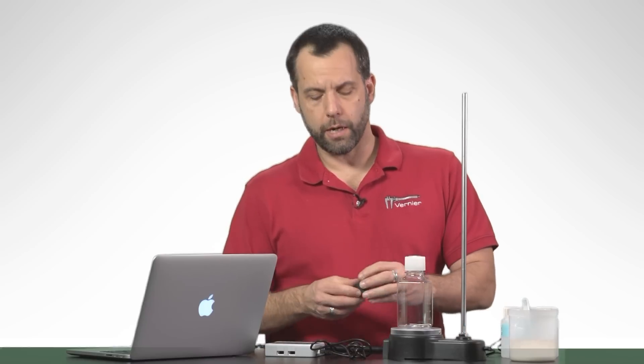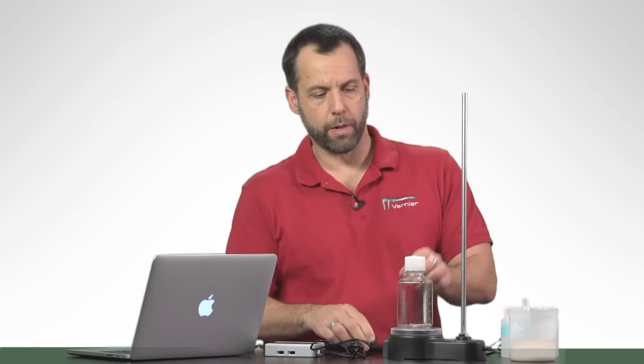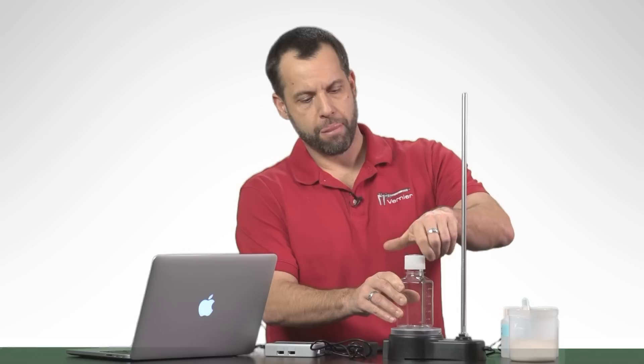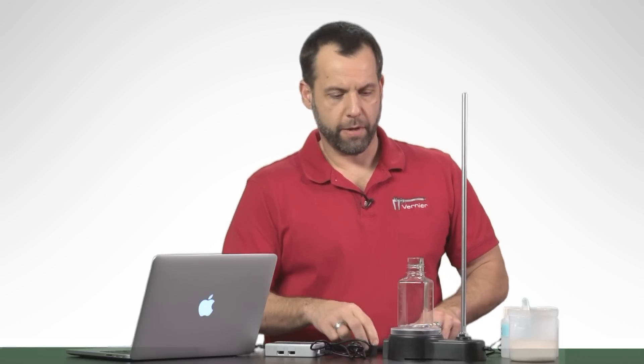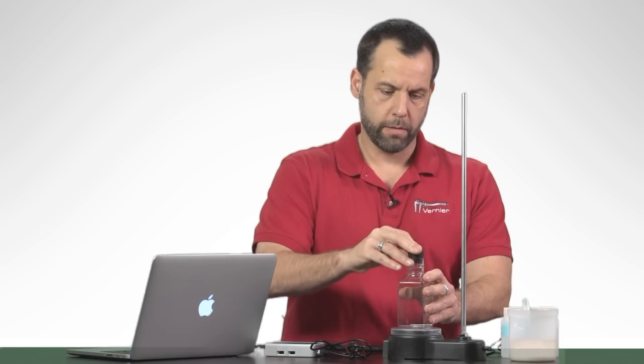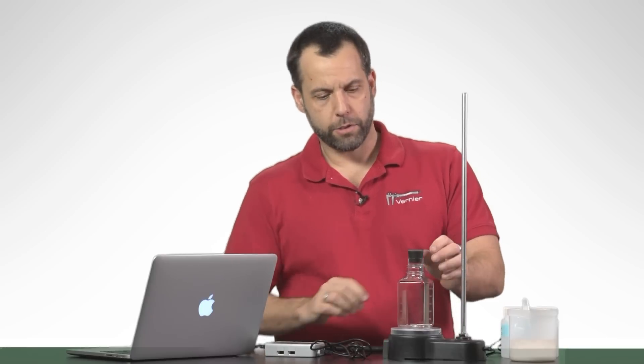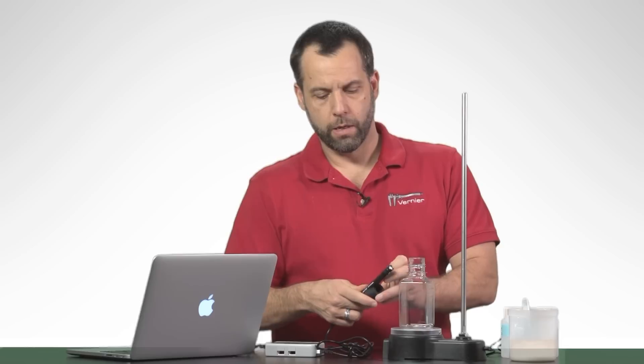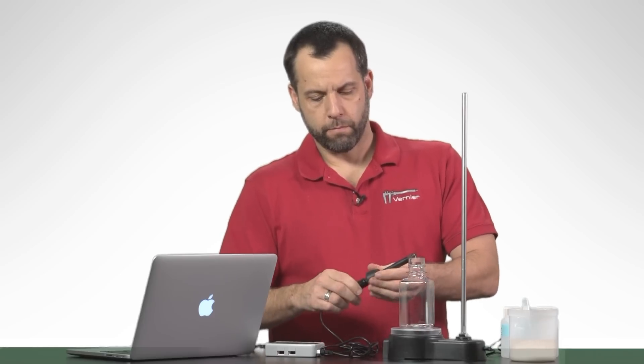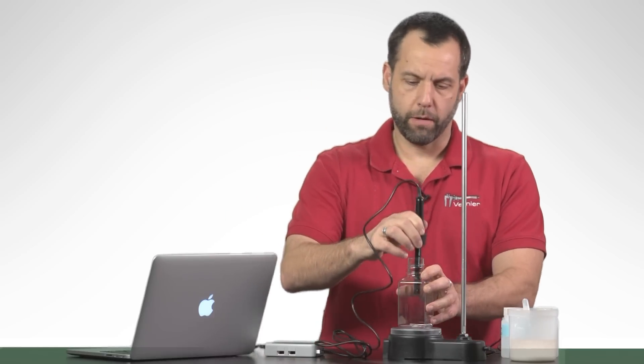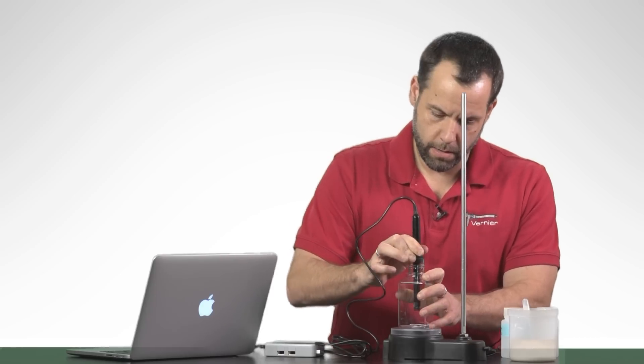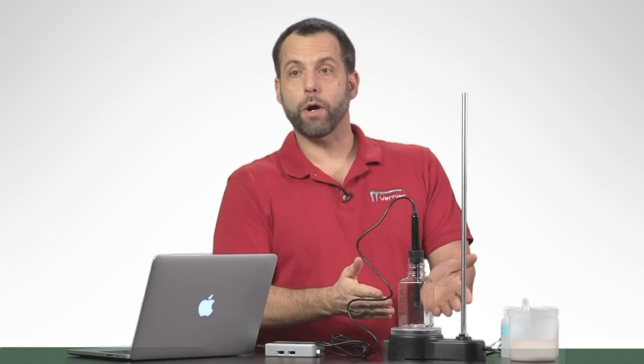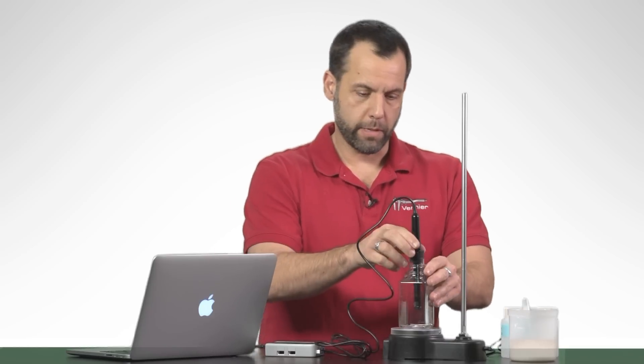The other thing that we're going to need is a little stopper, the split stopper. The split stopper fits right in the top of the Nalgene bottle. What's really nice is when we place the ethanol sensor into the Nalgene bottle, you can see that it will fit right down in it, and we don't have to worry about it actually getting wet or anything like that. So I'm going to take this out now.